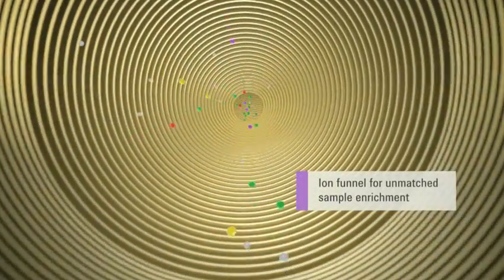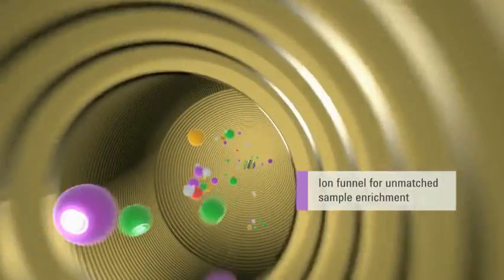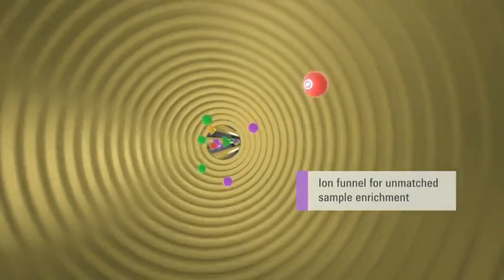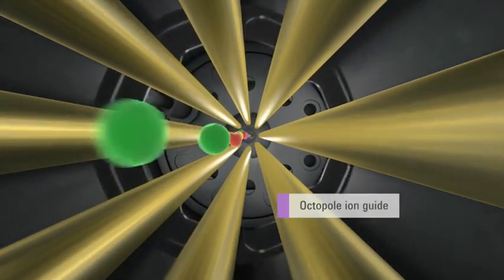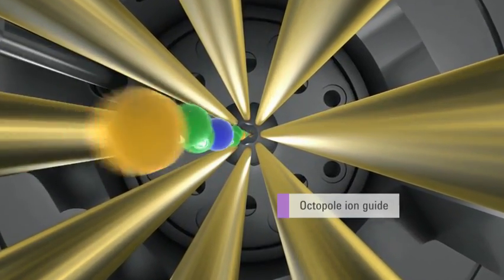The first ion funnel operates at high pressure and propels ions forward. The second stage funnel operates at lower pressure and provides further ion enrichment. An optimized octopole ion guide provides high efficiency ion transmission over a wider mass range.